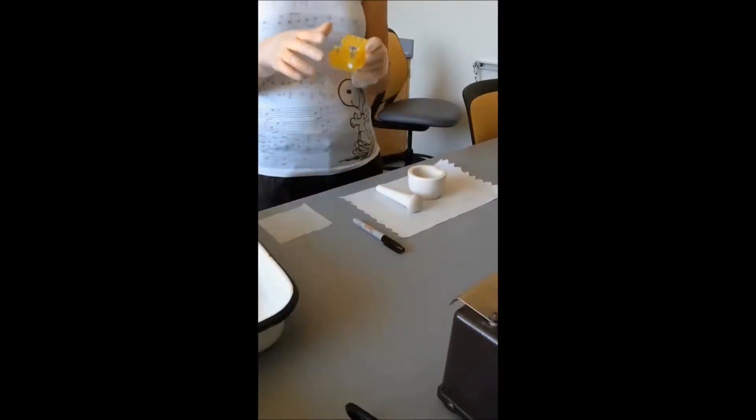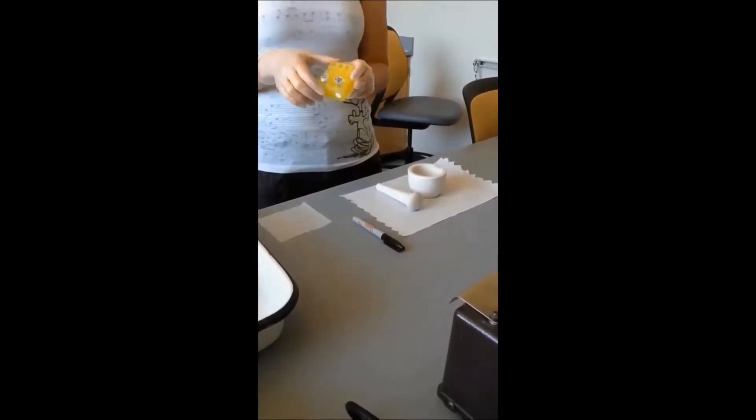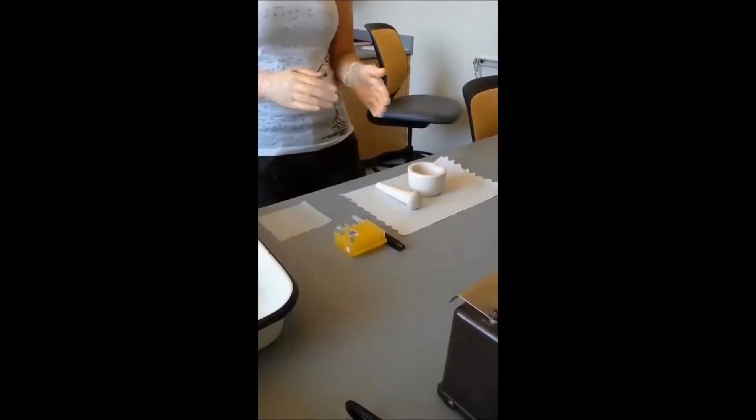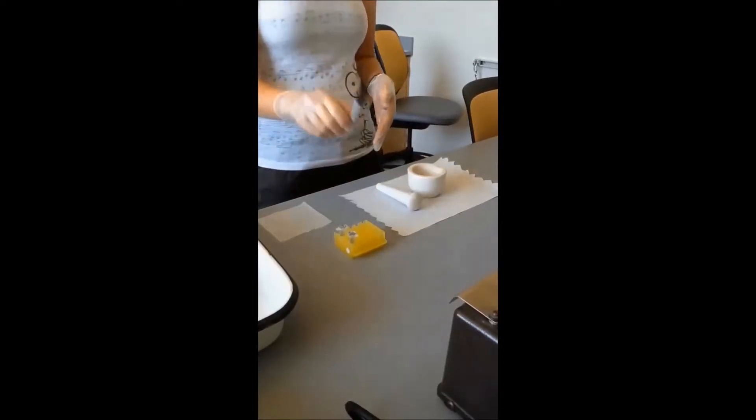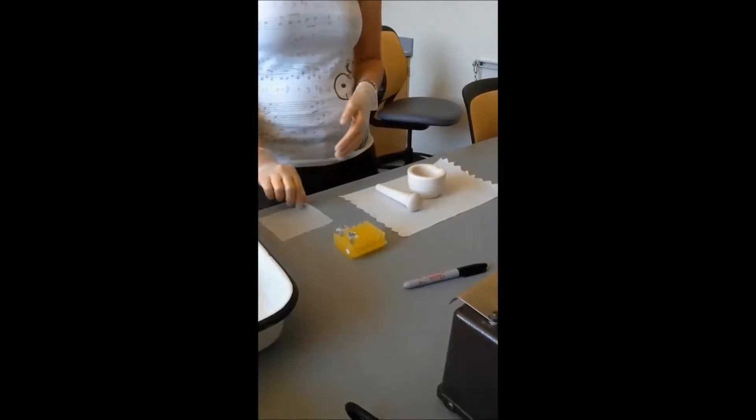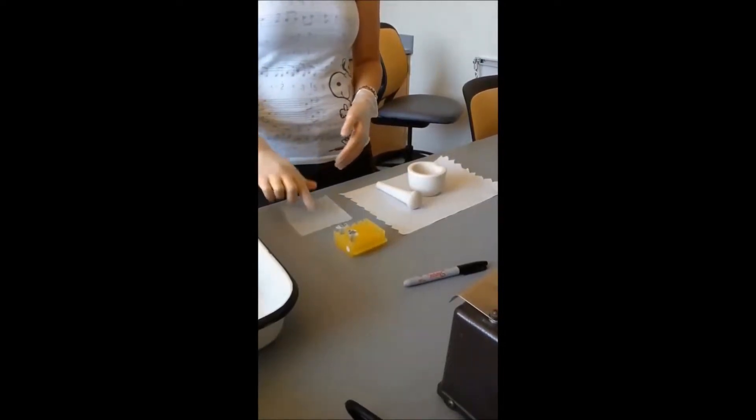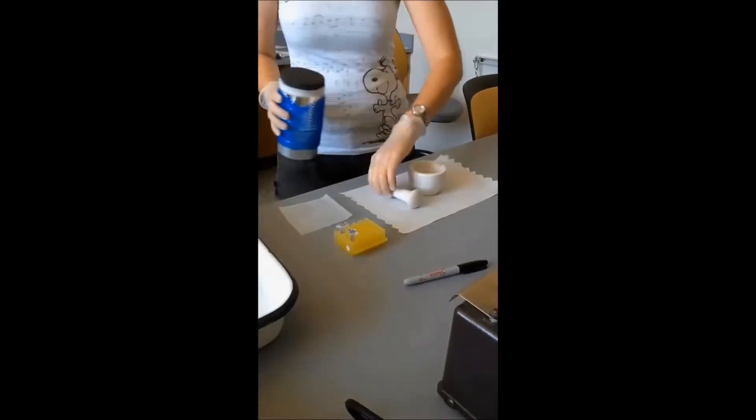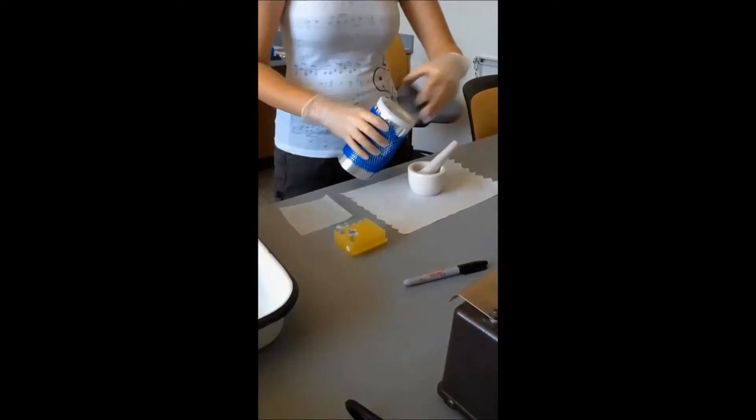We have two labeled 1.5 milliliter microcentrifuge tubes that we will be using to store the sample at the end, and we have a Sharpie to label those. We have some whey paper to obtain the sample on for ease of putting it in the mortar, and we'll begin by cooling the mortar and pestle with liquid nitrogen.